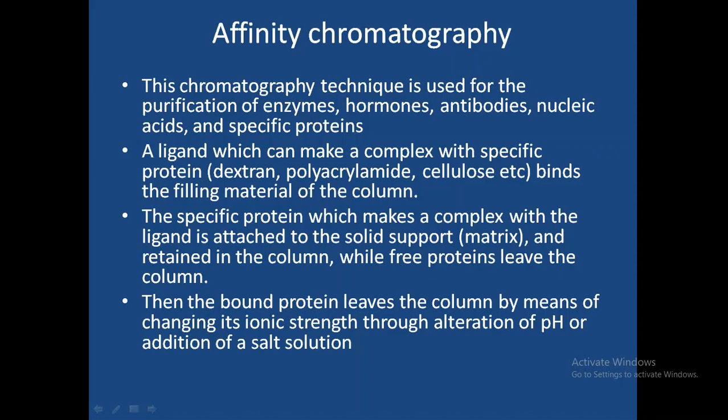So according to which, the column has to be filled with a suitable ligand which can bind with the specific protein present in the mixture with specific affinity, while free proteins leave the column. So those proteins that have affinity towards that ligand will be retained inside the column itself, and other proteins, those that don't have affinity towards that ligand, will leave the column.